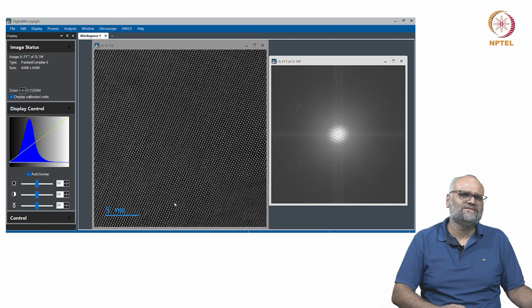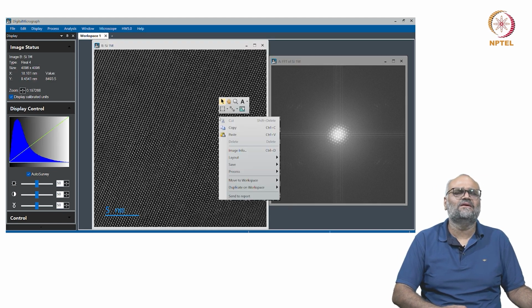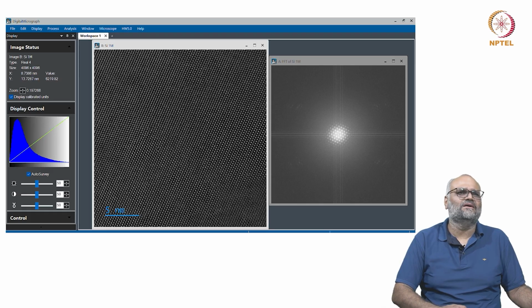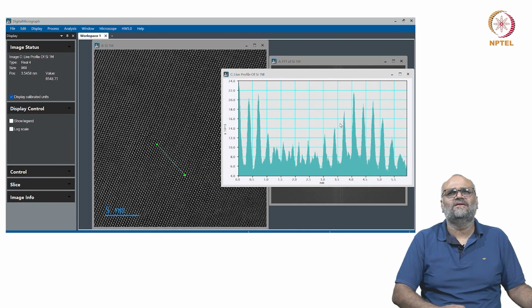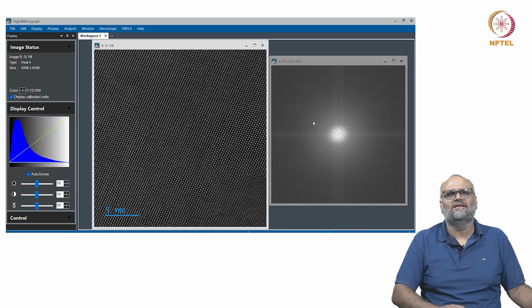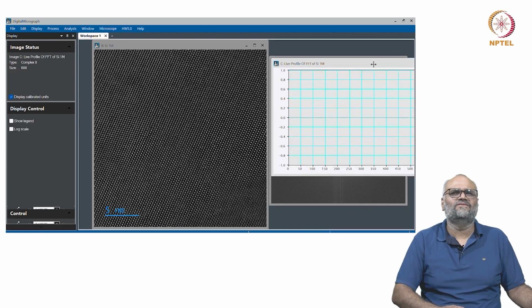So whatever direction is in this direction here, so if I draw it with a line like this, this would have turned by 90 degrees here, and it is in sort of this direction.